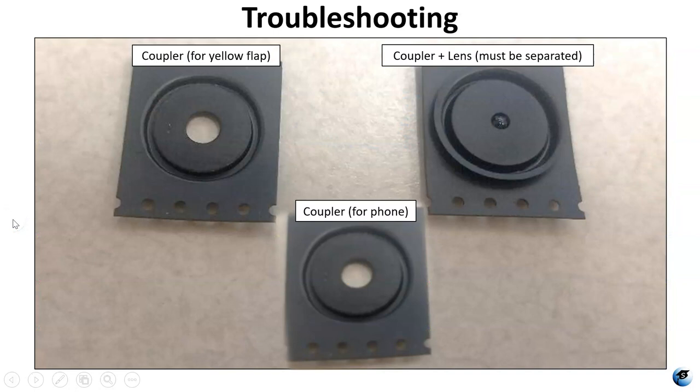Now here comes the troubleshooting. These are mistakes that I learned from and want to share with you. When you get your kit, the assembly video says you're supposed to have four little black pieces. I found that I only had three. I had what looked like two couplers and then a lens — except this is not just a lens, it's also a coupler. It's got the lens stuck to the coupler.